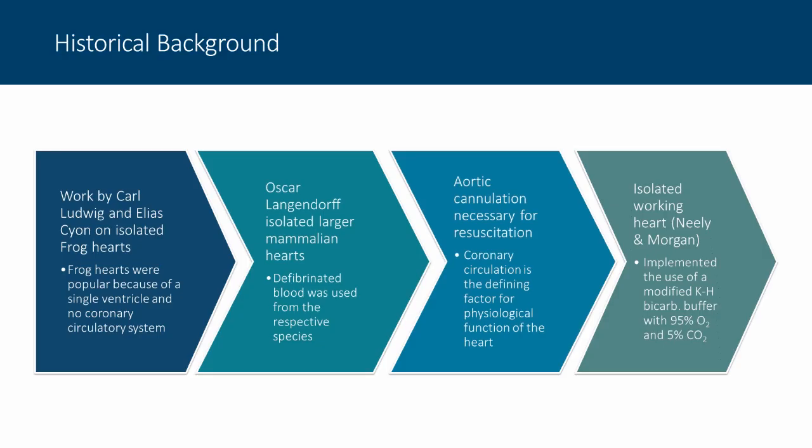In this aortic cannulation that results in what's known as retrograde flow, what we see is the aortic valve will shut, thereby preventing flow into the left ventricle. Instead, the perfusate passes from the aortic root via the ostia into the coronary vasculature to permit physiological function. And this is a real key to the retrograde flow. This was one of the many significant findings that have been made using this ex vivo system, including the respective cardiac effects of things like potassium chloride, muscarinic effects, and also atropine.